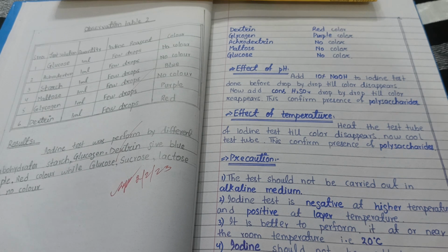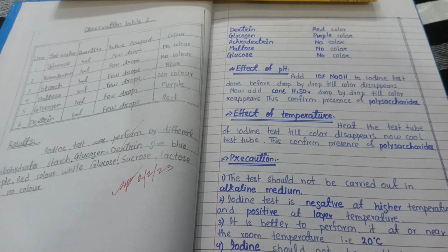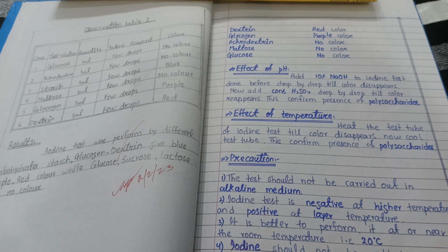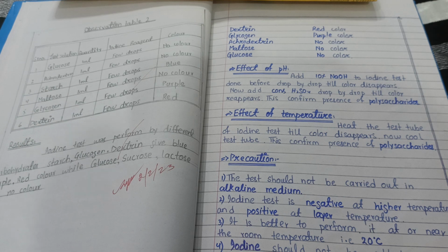The second thing is the effect of temperature. Whenever you heat this solution, you will see the color disappear, but whenever you cool it, the color reappears. But in the case of dextrin, the color does not reappear because it changes its structural properties. After that, there are some precautions: you don't have to add any alkaline medium into it. You have to maintain the temperature, because whenever the temperature changes, your solution is affected.